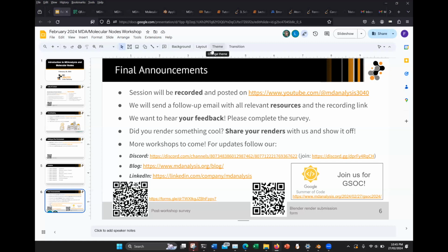I don't know the reason for that. Okay, so once you've added a transformer, then that's just the one that's on the trajectory forever. Yeah, well, you can always reload it as a new object. But the real answer is it's Python, so you can hack whatever you would like to hack. I'm sure there's just a hidden list somewhere, but there's no endorsed way to do that. Okay.